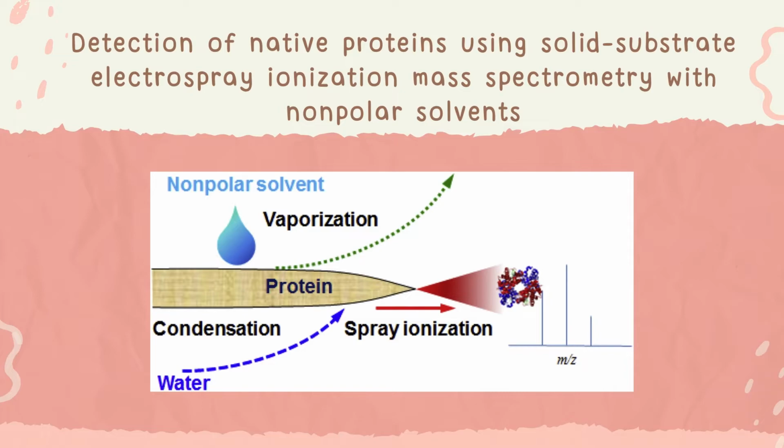Nonpolar solvents allow the spray ionization to occur at lower temperatures and with fine plumes, which are believed to lead to detection of proteins in their native states.